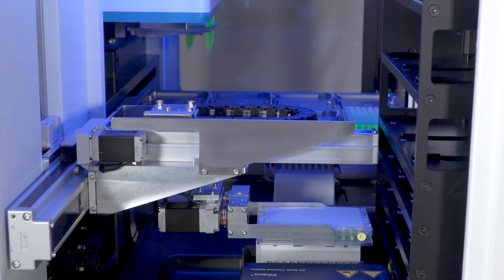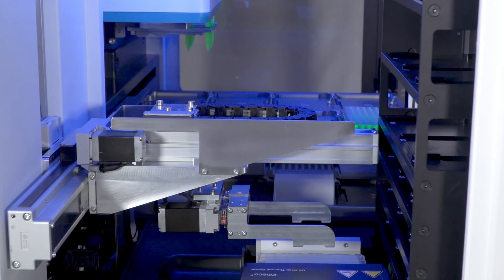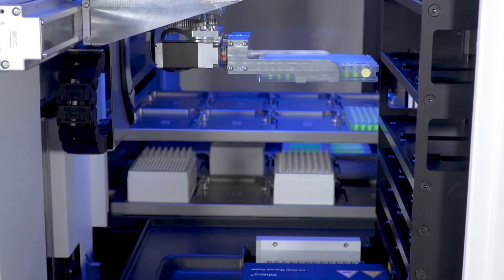In the real protocol you can perform PCR processes. Now you can see the gripper going back to collect the plate from the ODTC — the on-deck thermocycler — in the PLUS module.